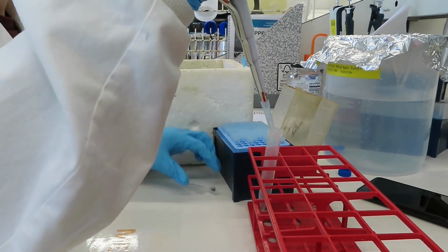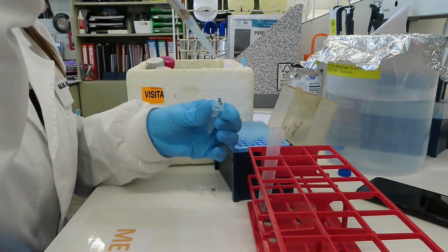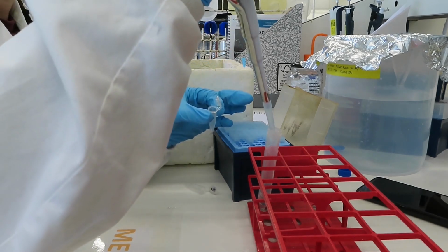By using size exclusion chromatography, a more pure and homogeneous protein has been obtained, eliminating aggregates and unspecific proteins of different molecular weights that were purified with our protein in the IMAC method.